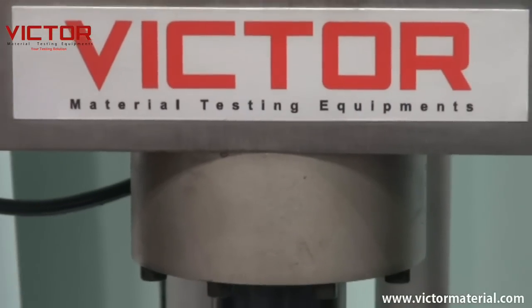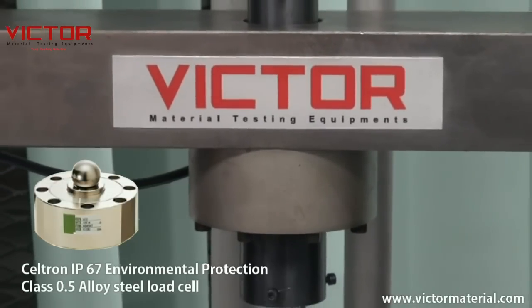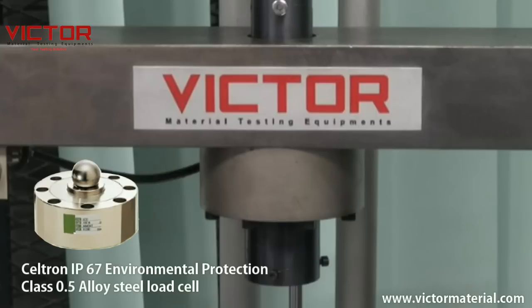Victor's load cell uses a high precision Celtron IP67 Environmental Protection Class 0.5 Alloy Steel load cell with both tension and compression loading to ensure high accuracy.